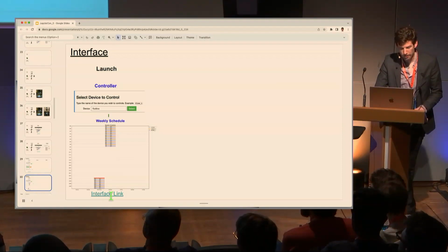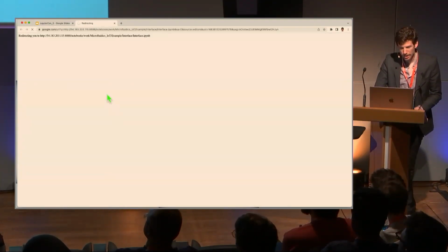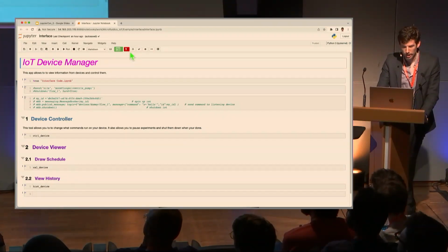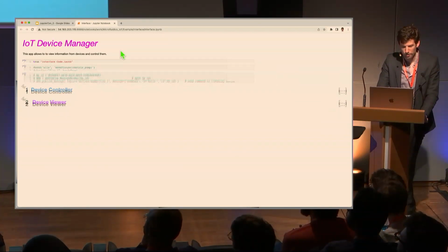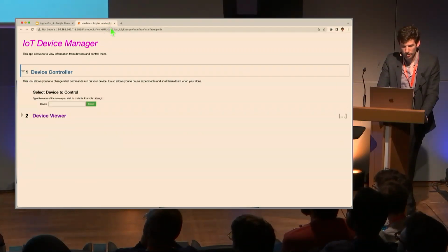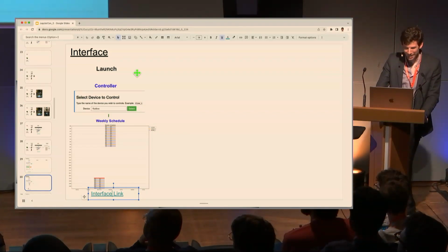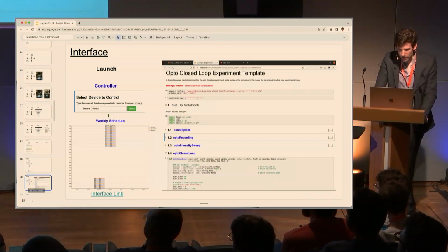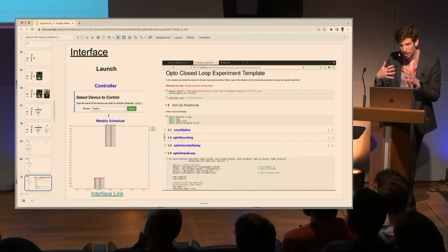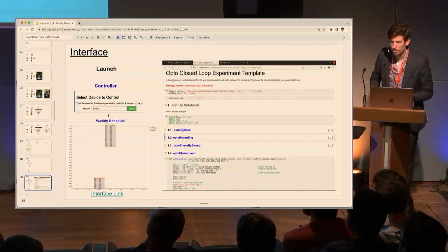And again, just like everything that I'm showing, this is not like, oh, this is something we are thinking about building. No, this is the actual code. These are websites we go to all the time for running these types of experiments. This is just very common for our lab. Oh, let's see. I want to make sure, oh yes, I can safely close that. Okay. Now also for some of the more complicated stuff, like how I was talking about those closed loop machine learning style algorithms, for that you really want to do more nuanced code.